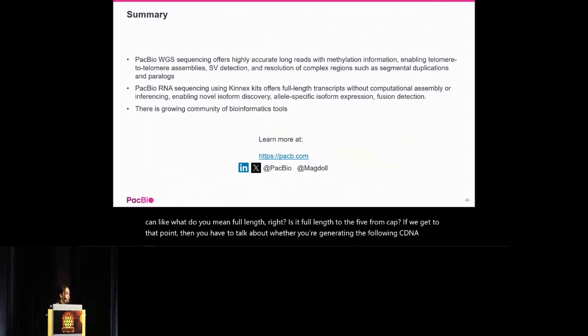Because I think now the problem is less about sequencing the reads, because we can sequence. If you can make a 30 kb cDNA, we can sequence it. The problem now is the chemistry to be able to generate a full-length cDNA. What we see a lot is 3-prime bias, for really long transcripts. I'm just going to mention Titin. I have yet to see a 30 kb cDNA of Titin being sequenced on PacBio. I've only seen maybe 10 kb of Titin, fragmented along the gene, from both the poly A tail and the dT priming of intronic regions.